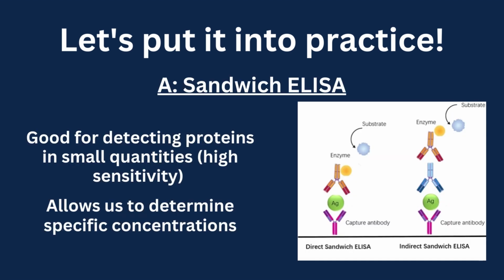If you said sandwich ELISA, you are correct. As the proteins you are detecting are likely present in small quantities, and we wish to accurately quantify the concentrations, sandwich ELISA would be best for our purposes. So let's run it together.